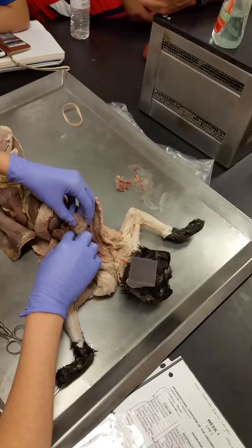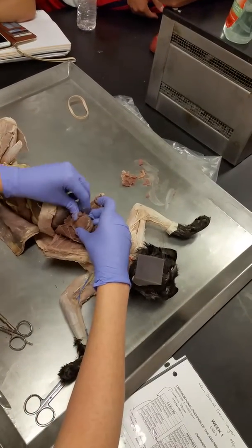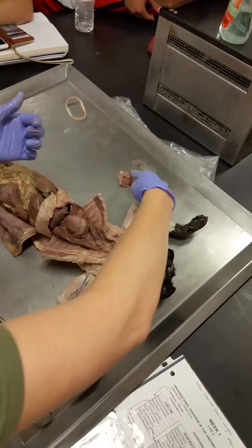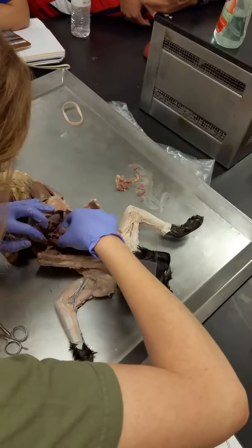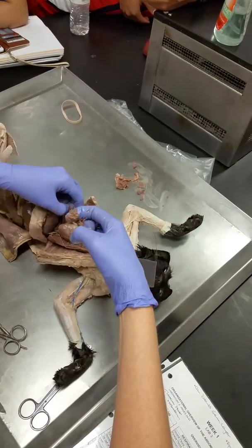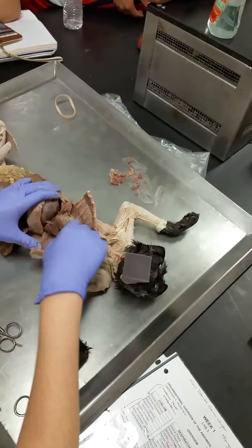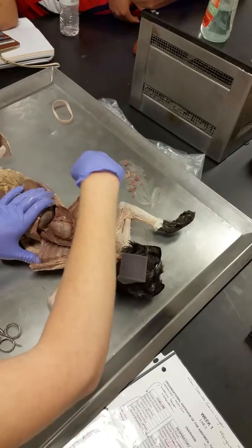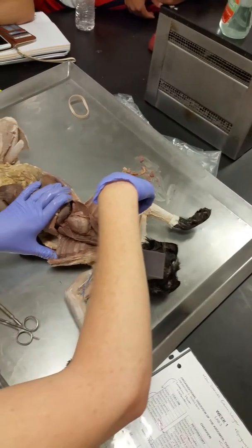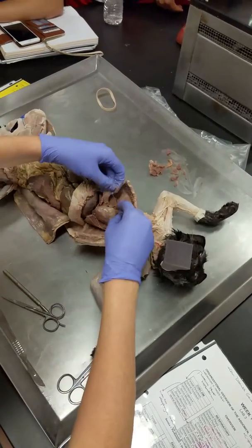Right. So there, I've removed this pericardium. What a lot of people do, because I've got lots of gross blood in here, is they take their cats and run them under the faucet and rinse some of this out. So if you get a cat that's gross like mine, where it's super slimy inside and there's lots of this dried blood goo, you can stick it under the sink and rinse it out, and that's totally okay. Lots of people do it.